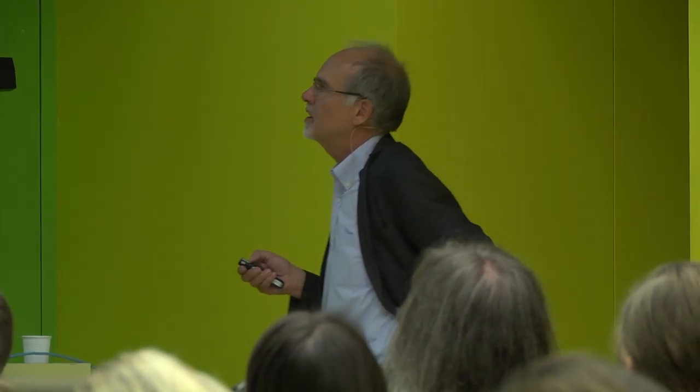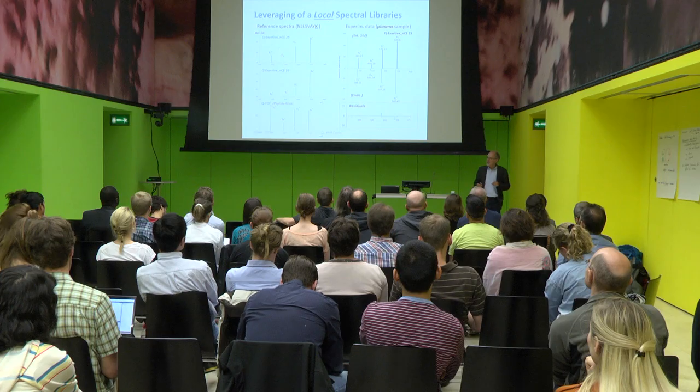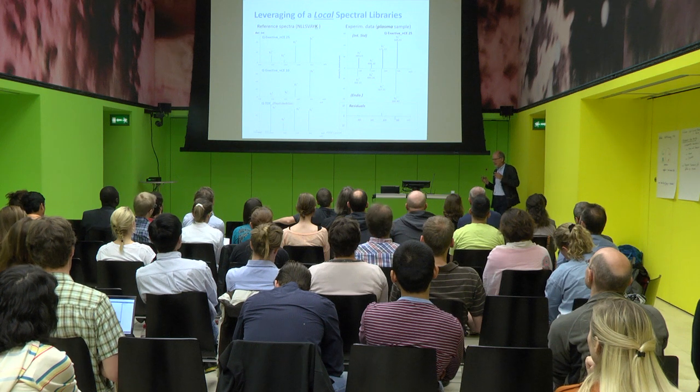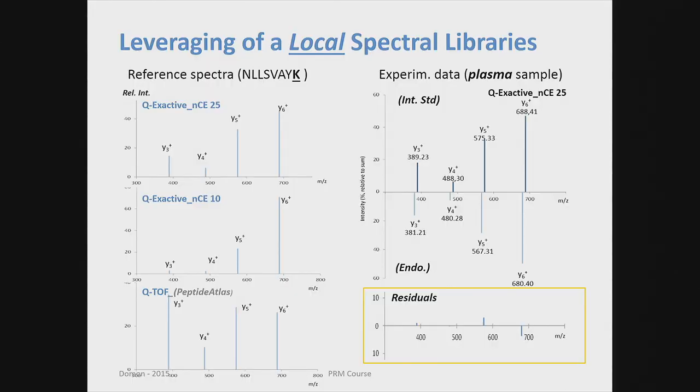And now if we want not only use the masses of the peptides to make identifiers, but we also use the intensity or the relative intensity, it is quite important that we define exactly the conditions. And in some of the large scale experiments we'll discuss later on, it is quite important that you actually make sure that the reference spectra are measured on a platform under similar or same conditions.